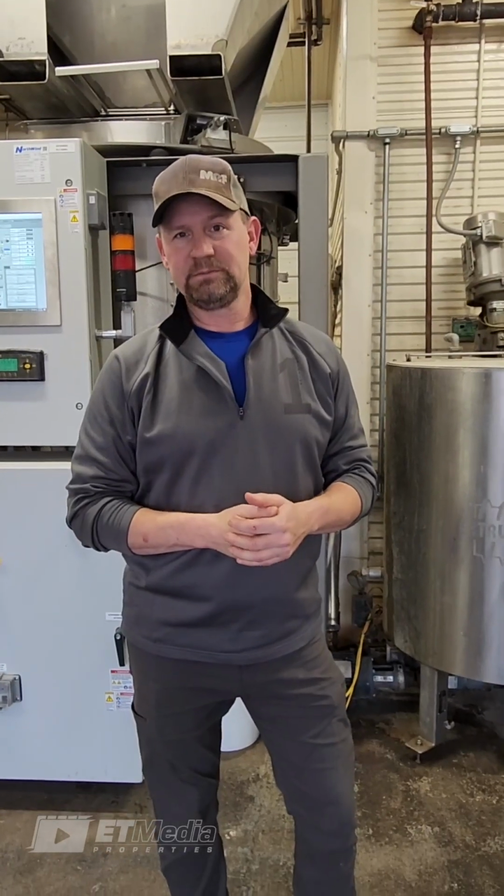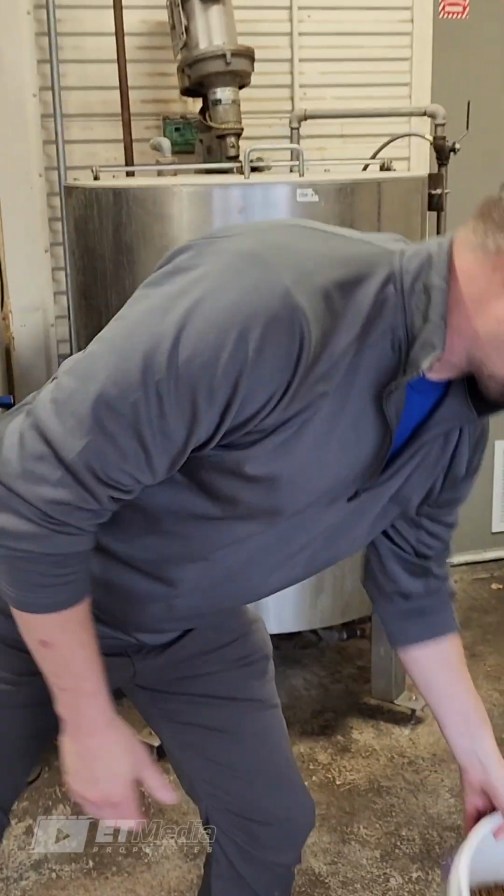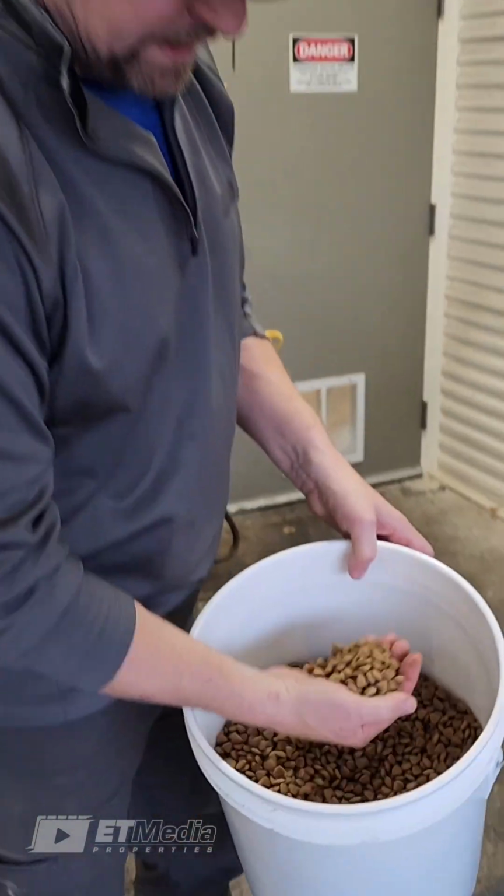Today we're going to be talking about density measurements. So for the example today, we're going to be using a sample of dry kibble here.